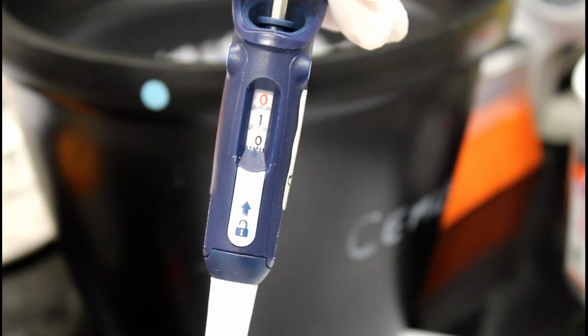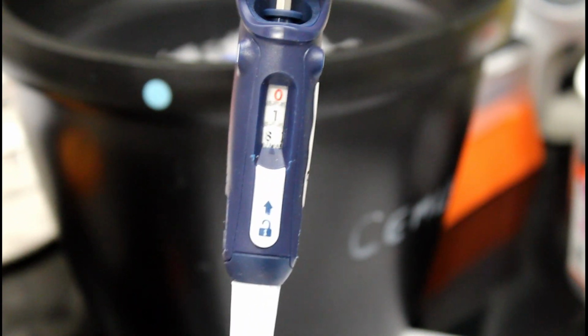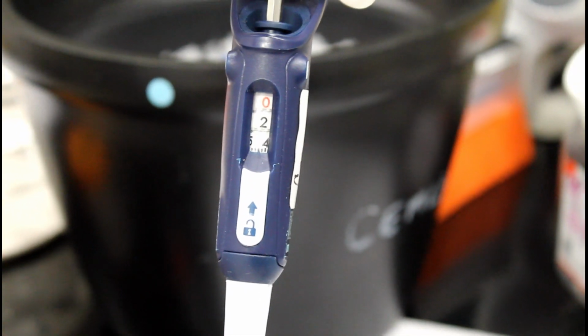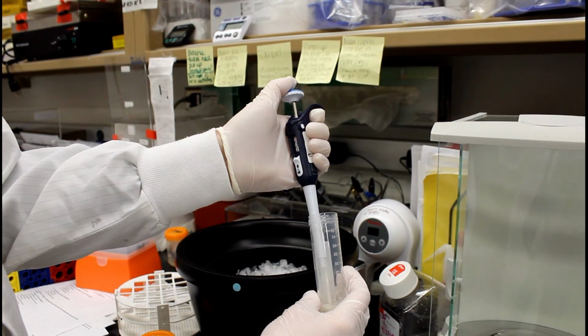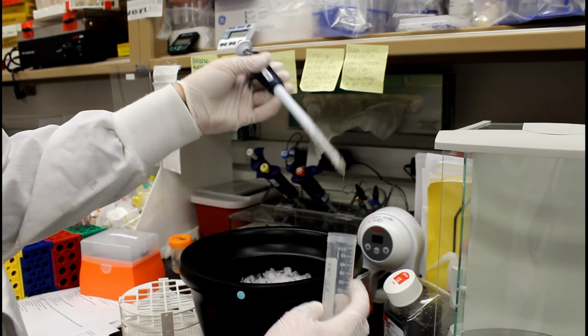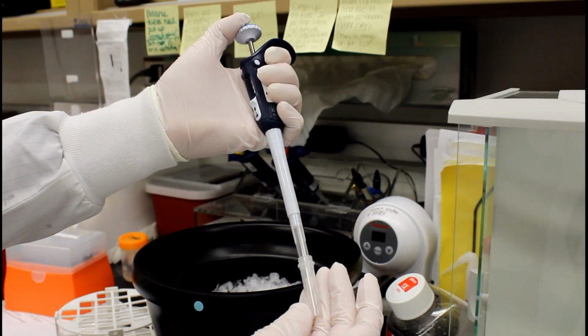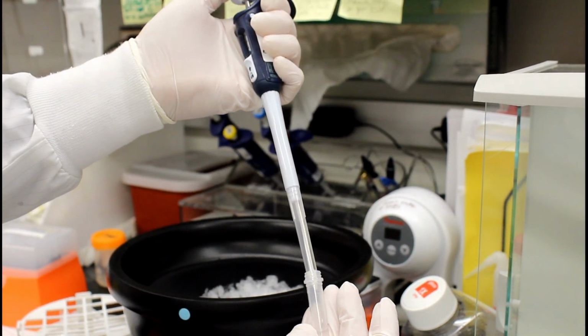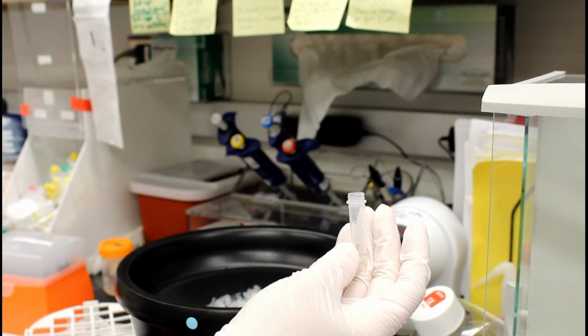Next, acquire between 0.1 grams to 0.25 grams of sample and deliver it into the microcentrifuge tube. Next, record the weight on the scale.